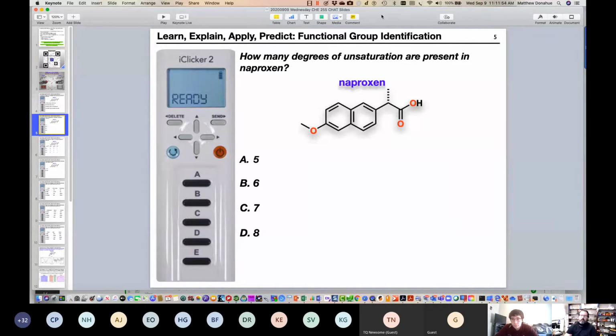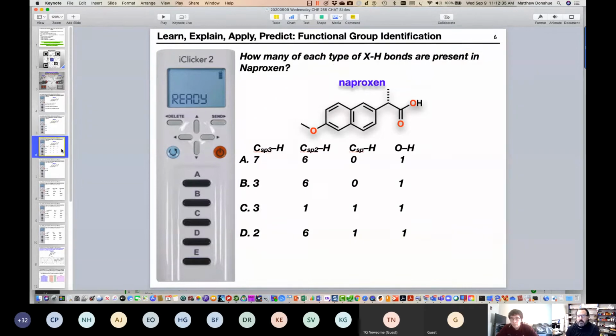So again, the big picture of Module 2 is looking at structures, pulling out this information, and really understanding that, even though this is a black line on a white slide, what does that mean? This is a red O. What really does that mean? So how do we know that is the structure of naproxen? And again, we're going to use mass spec, IR, and NMR to answer those type of questions. So this one will kick it up a notch in terms of level of difficulty.